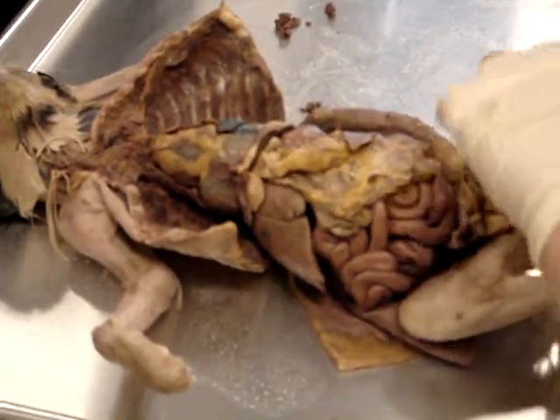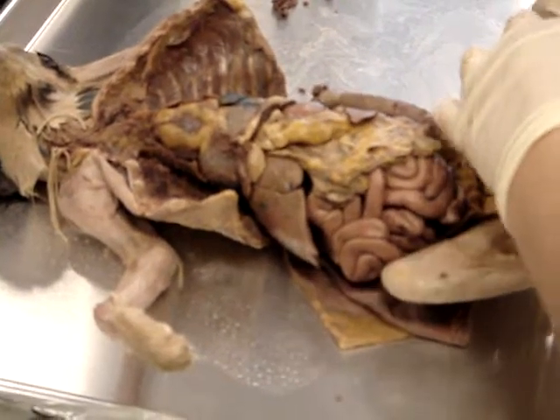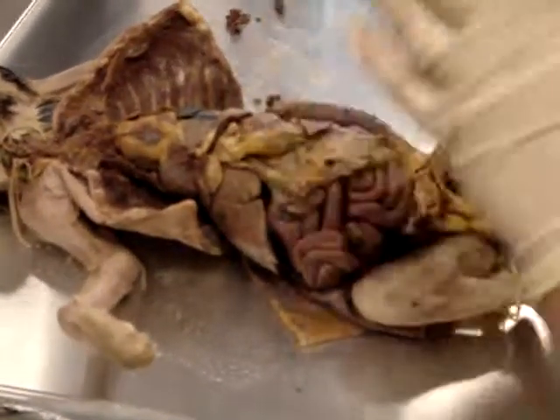I'm going to cut your cat's tail off because it's just bothering me. Is that okay? Oh, wow. Yeah. Sorry, it keeps poking me. Disgusting.